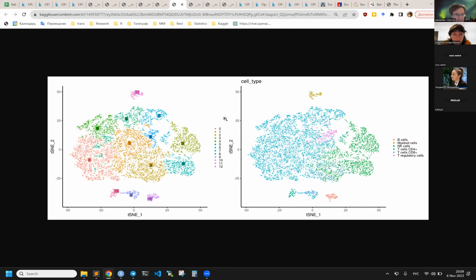And do we have some interpretation that some clusters can be related to some drug classes, for example, or to something? It would be great if you could classify the drugs into groups, because if you color all three pictures with clusters by all 144 drugs, you just see an equivalent distribution, no patterns.